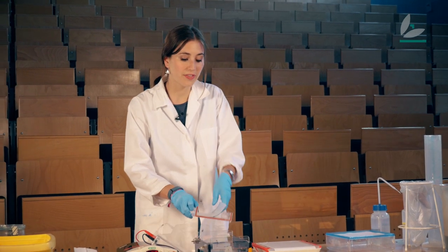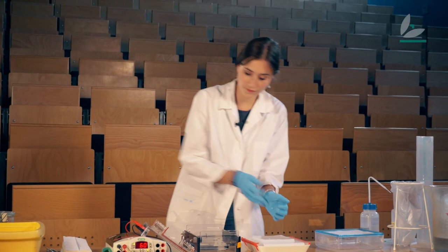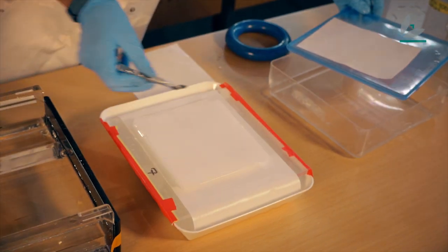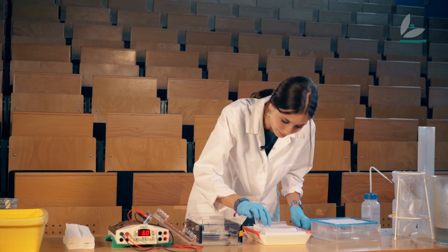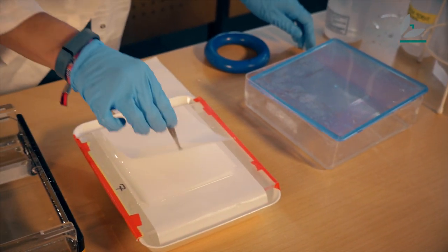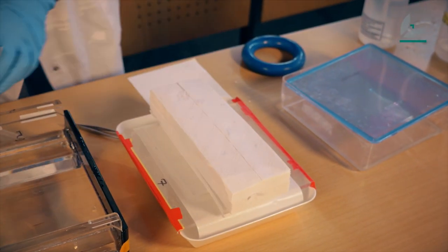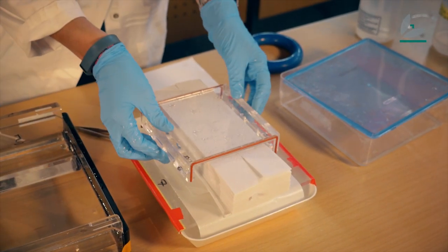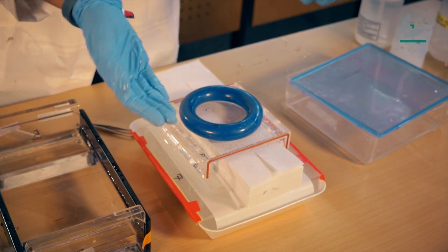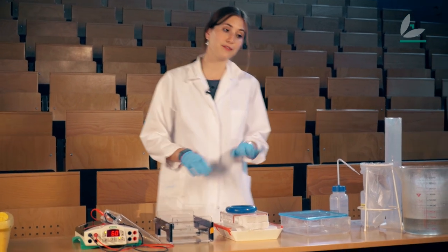But in order to detect them I have to transfer them to a membrane. So I'm going to put the gel here and put the membrane on top of it. And carefully I'm going to remove the air bubbles. Then I place a piece of paper on top, and some more paper, with a weight on top of it. This box has a liquid with lots of salt in it, and it's soaked by the paper through the gel into the membrane, taking with it my RNA molecules.